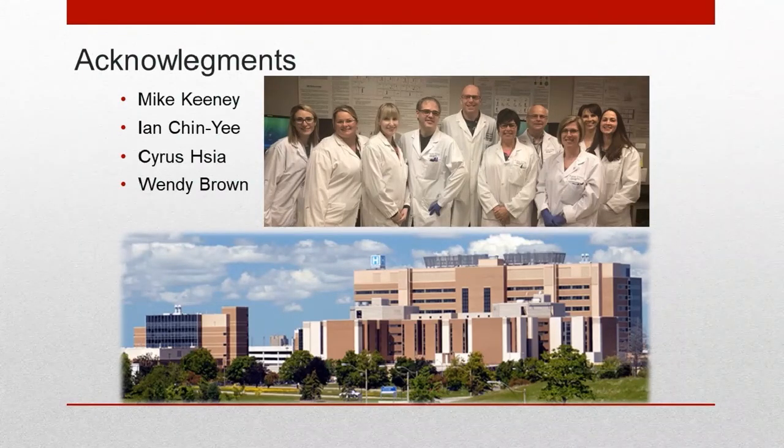The M2 tube does allow you to do that sort of analysis. It has the markers in there: DR, 34 and 117, and it has 38. It allows you to distinguish maturation of blasts. You could do it, but like I said, it's not what the tubes were designed to do.